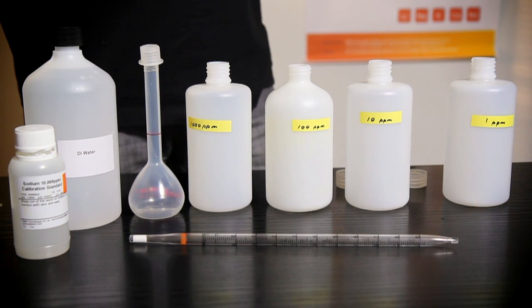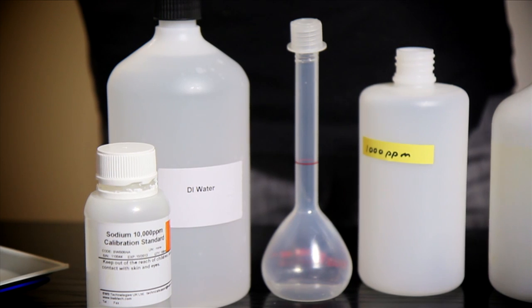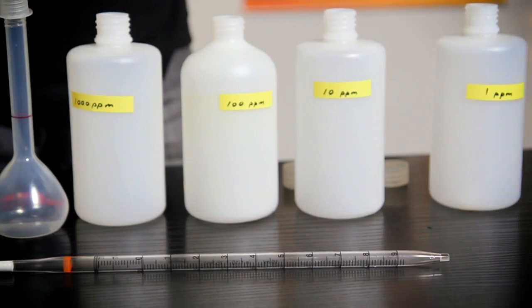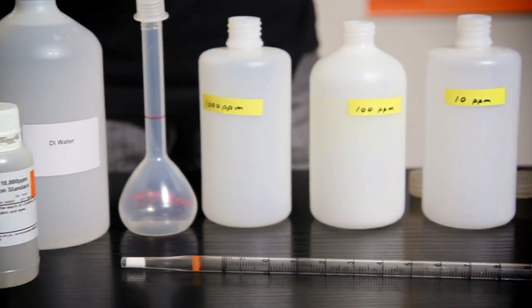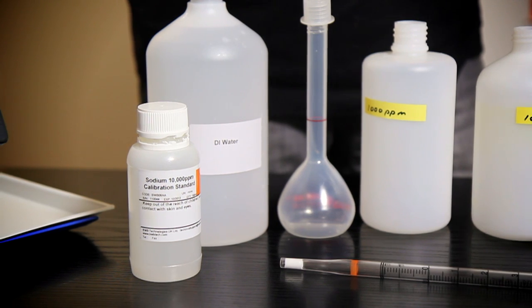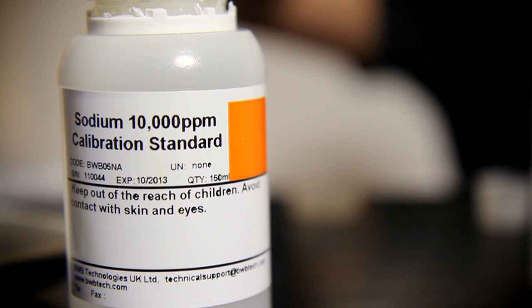For this exercise you will need four labeled beakers, the 100 ml volumetric flask provided with your BWB XP, a 10 ml pipette also provided with your BWB XP, and ion standards. The ion standard we are using for this tutorial is the 10,000 ppm sodium standard.